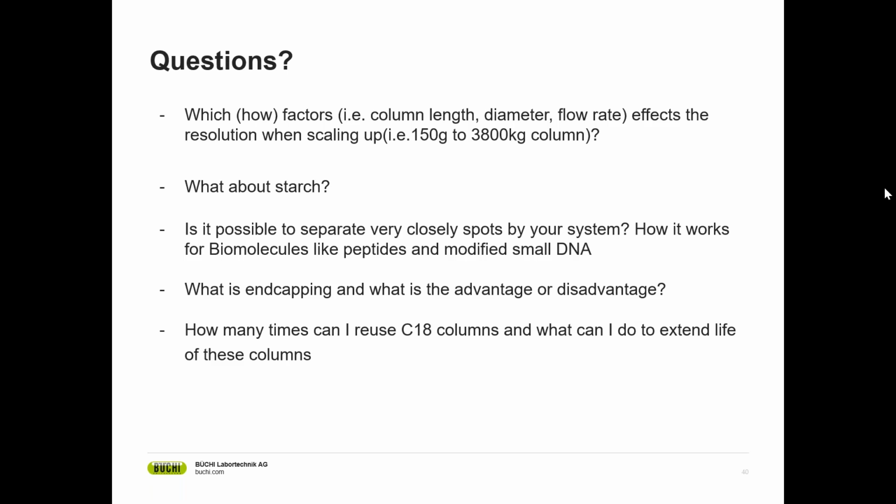And then I've got a question here about an ethyl acetate fraction from a plant extract. What do you suggest to separate the compound from the ethyl acetate fraction? So here, if it's an ethyl acetate fraction, I would try a TLC with normal phase, see how the separation works. Ethyl acetate and hexane work quite well, and most probably you'll get a good separation out of that.